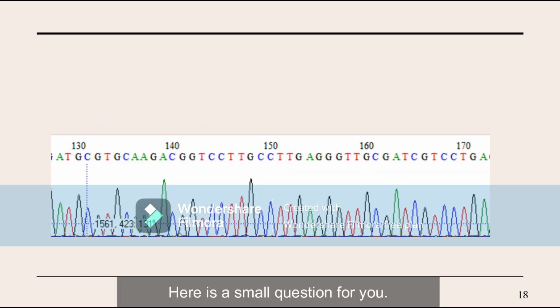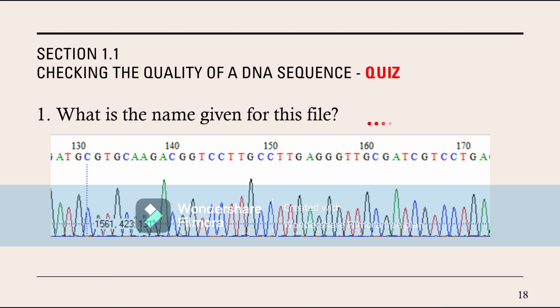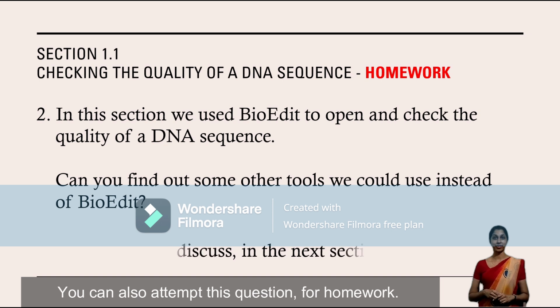Here is a small question for you. See if you can answer it correctly. Yes, this is a chromatogram. You can also attempt this question for homework.